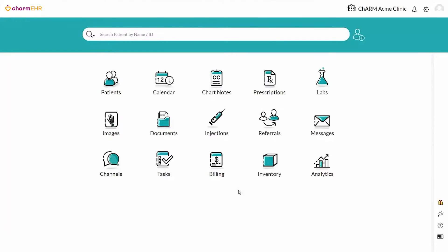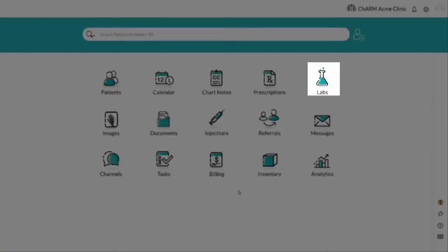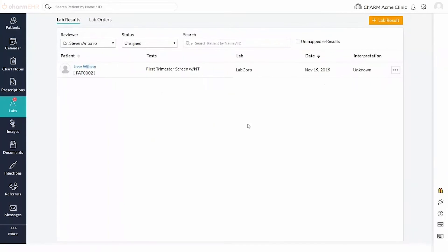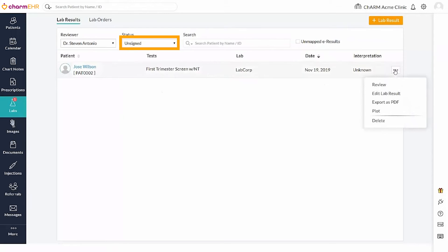The Received Results will be available in Labs, Lab Results, as well as the Patients Dashboard in the Lab Records section. Received Lab Results are in the Unsigned status. And reviewers can review the results using the Review action item.